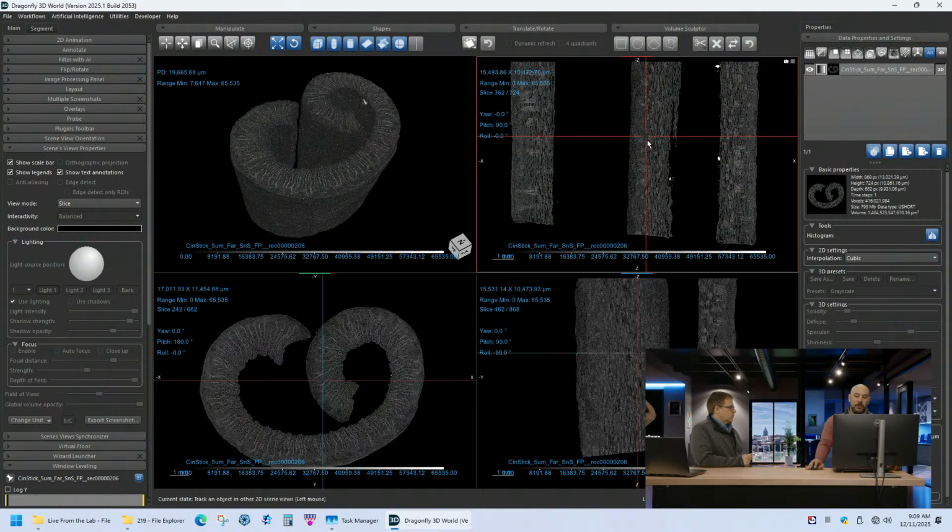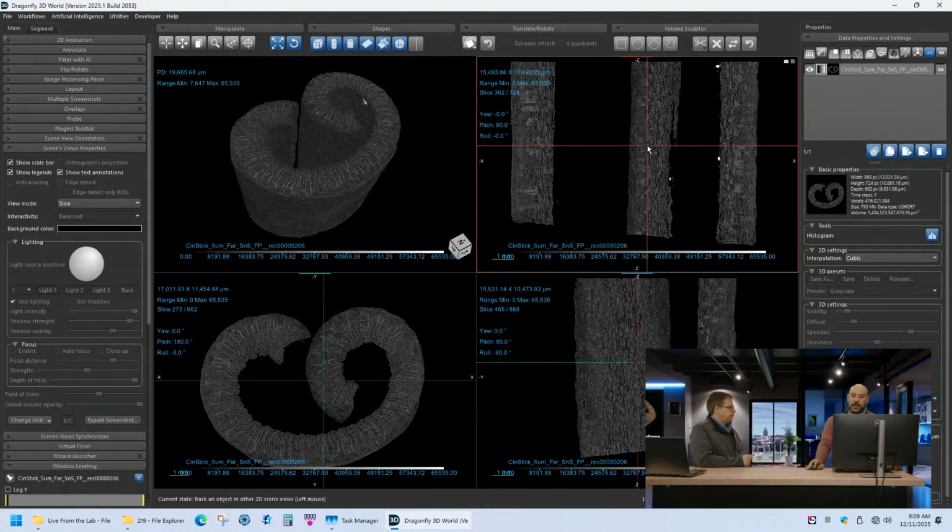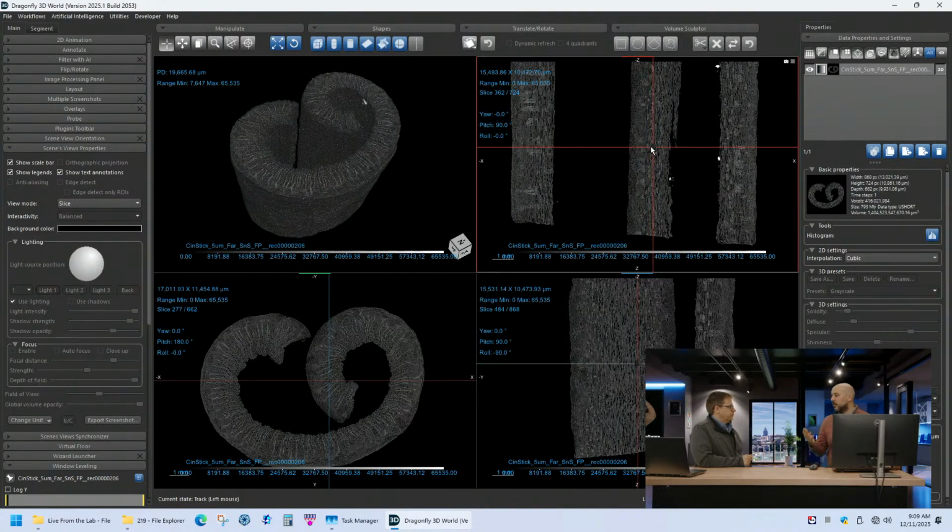Some people already have it. Some people have sought out different software, like you were saying at the start of this. There's a bunch of different data analysis software out there. This just happens to be one of them. Some people already have this through searching out other software on their own. Okay. And you do need a license for it. You do need a license for it. Yeah, correct.